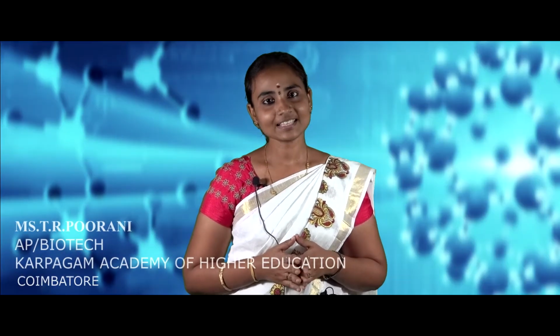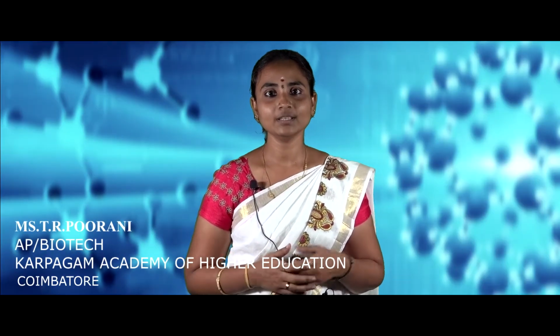Hi everyone. In the last lecture series, we saw the mechanism and working principle of reverse phase chromatography. In today's lecture series, we will see the mechanism and working principle of paper and thin layer chromatography.